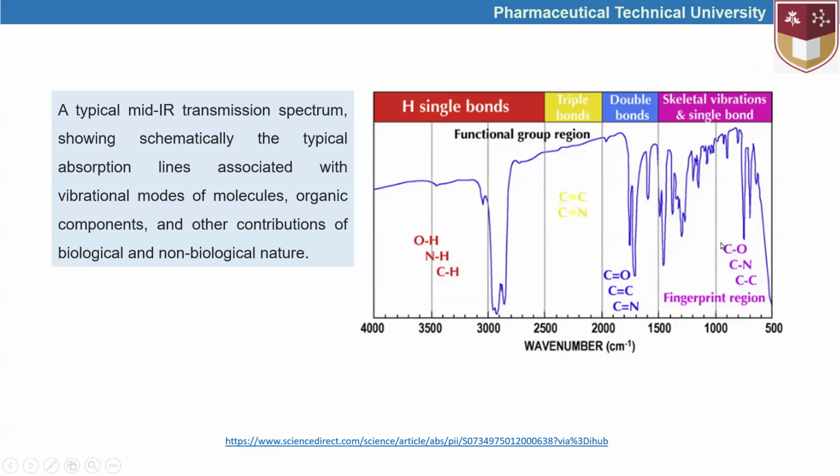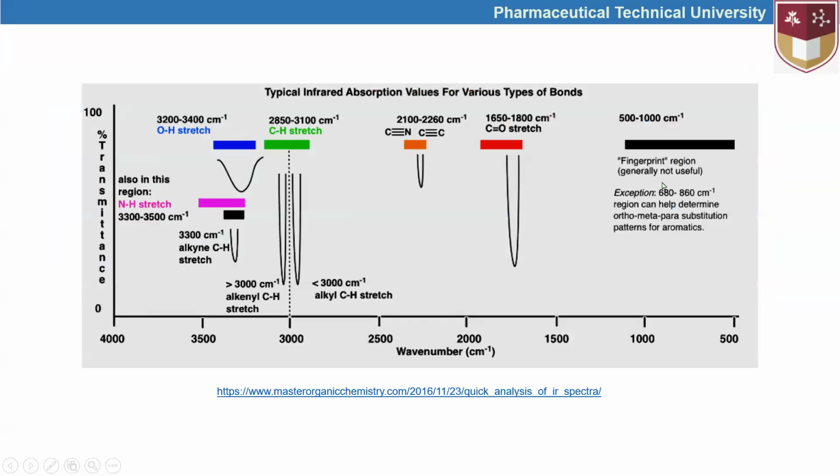They are present here, but in the composition of a more complicated structure. That's why it is interpreted as the fingerprint region, used for skeletal vibrations and single bonds.